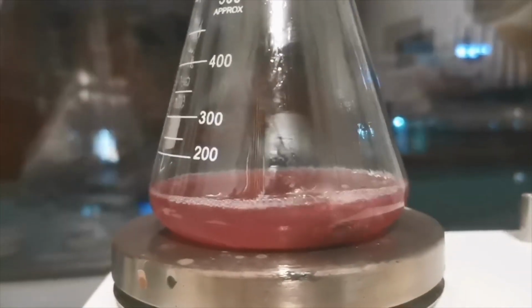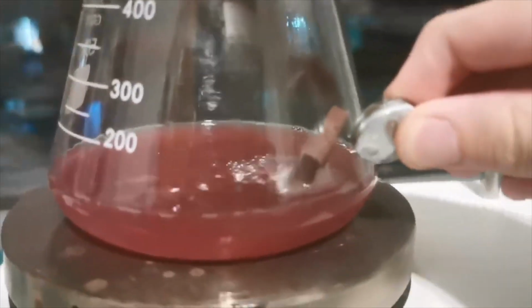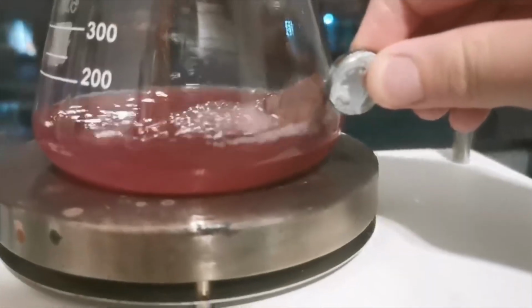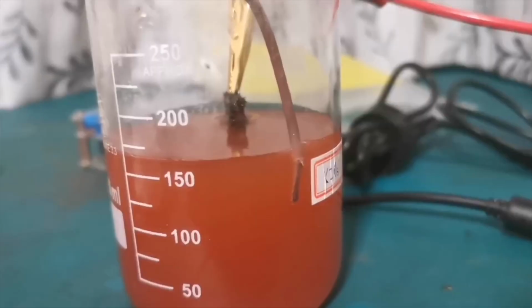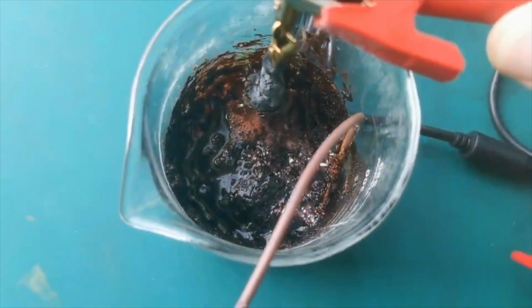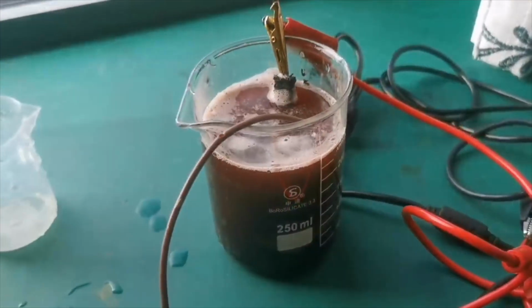After 4 hours of constant boiling and several additions of acetic acid, the mixture darkens to a purple-red color, but the magnet still didn't change in size and appearance, which was very disappointing. What is even worse is that when the solution cools, the reaction completely stops. I then came to my method of last resort, electrolysis. I set up a simple electrolytic cell with the magnet as the anode to try to make things go faster, and I ended up with this sludge of dark material after a day. I added back some water and was quite happy to see that the color of the solution darkened.